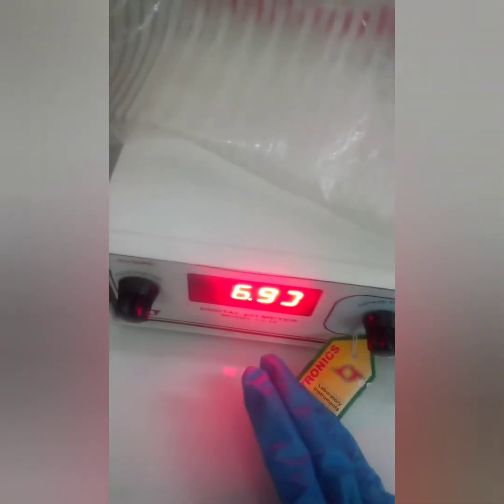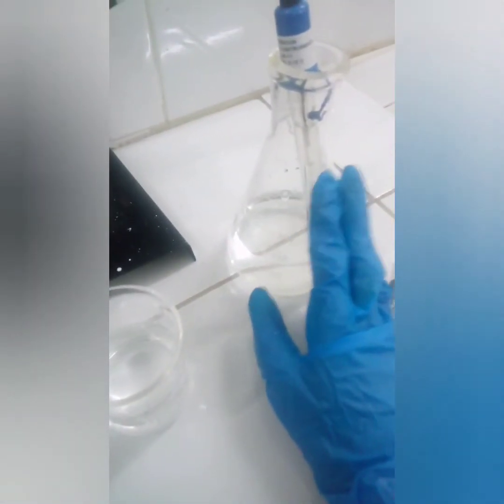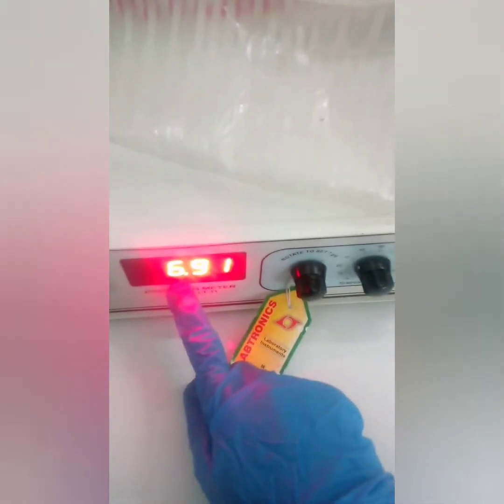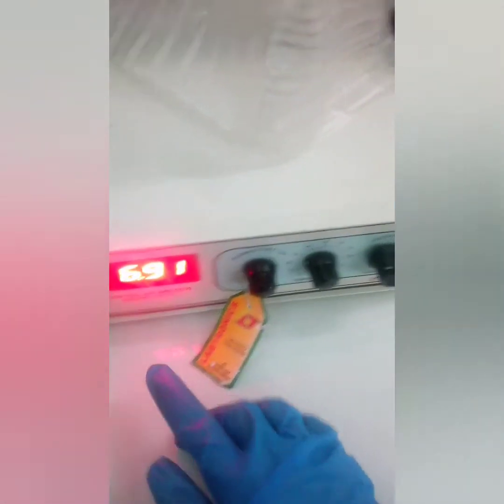So if it's more, we need to bring it down. You have to add acid. And if it's less, suppose it's 4 or 3, that means below 5, in order to bring it up and make it more basic, we will add sodium hydroxide that we have already prepared. Now to bring this one down, we need to add acid. So in this way, you have to use this instrument to measure the pH of this buffer.